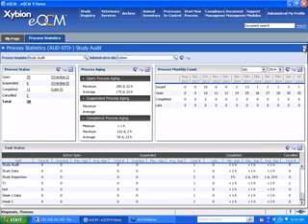That pretty much covers all of the audit functionality. We've gone through the audit planning, nonconformance, CAPAs, audit reports, process statistics, and the audit program. So Megan, that pretty much covers everything I had. If there's any questions, again, these webinars are meant to just give you a little example of the actual functionality of the system. If you need more information, contact us and we'll be able to do a longer training session and look at your process and tailor and configure it for your business process to show you how it will really benefit your operation.